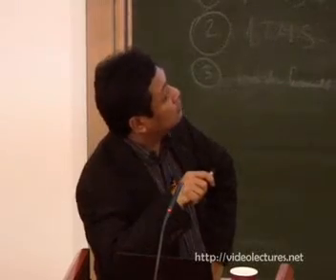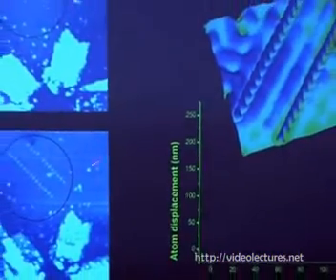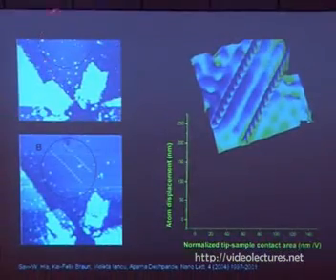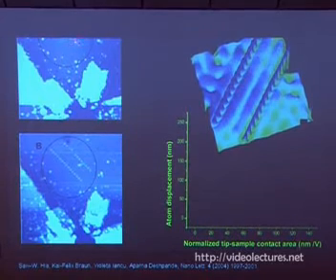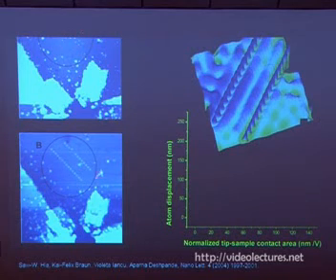The first one is by using brute force, just by crashing the tip into the sample. If we apply the correct voltage and crash it, what we find is this crash site, for example. Far away from the crash site, you will see individual atoms scattered. Close to the crash site, you will see big clusters. And the atoms I show here are reorganized to build a structure. For example, in this case, we drew 2 lines. Here is a 3-dimensional image of these 2 lines. These are the individual atoms, and what we see here are electronic waves between the 2 lines of atoms.